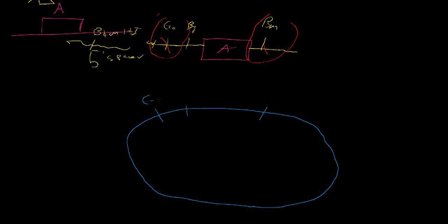So E, BG, BM. And we have some sort of a dropout. Usually we'll just stuff an RFP in here or something like that, just as a placeholder, so that when you digest and run it on a gel, you can see that there's been a change in size of the two bands. So you have a dropout. So any singly cut should be apparent. This is about 1 kb. And also an RFP will show up the next day as red and will tell you what clones are background.